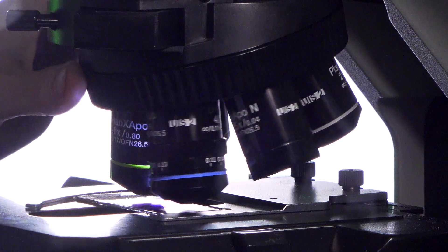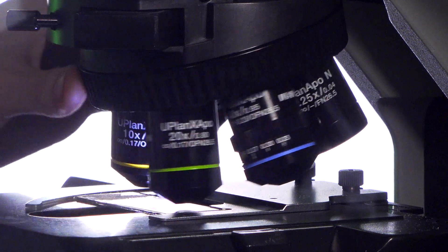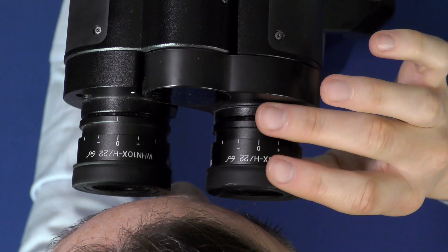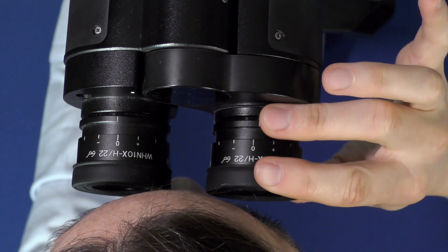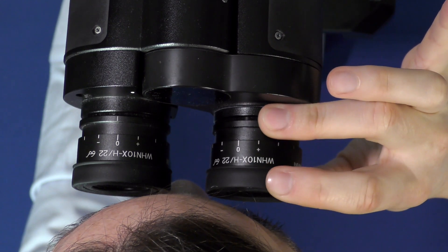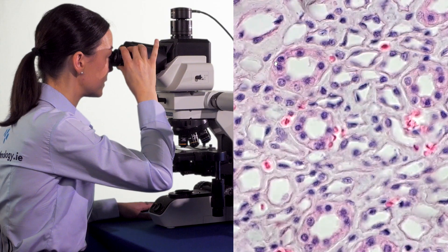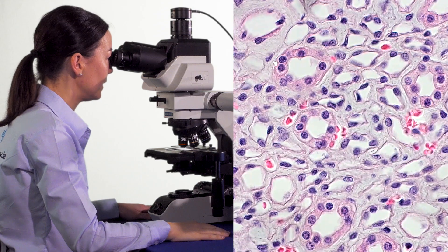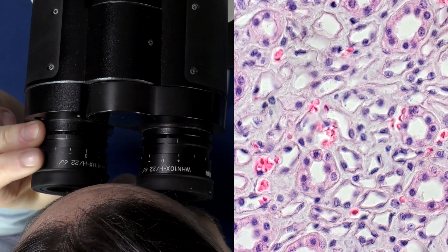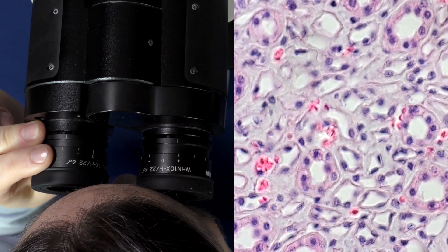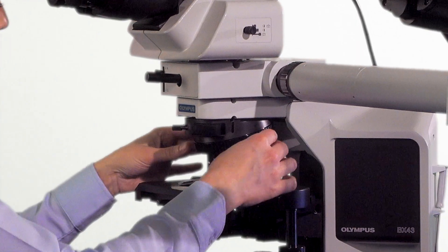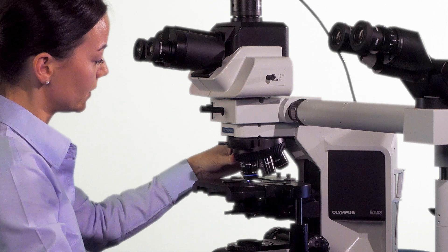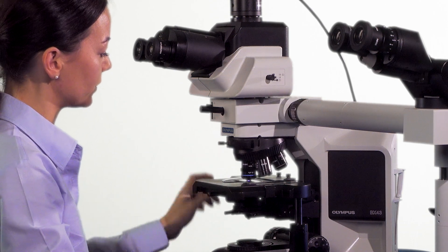Go down to your low-powered objective, something like your 10x objective. Using your right eye, focus your eyepieces using the diopter adjustment until your image is in focus. Repeat this step again for your left eye by turning the diopter of the eyepieces. When you go from low to high power, your image should remain in focus.